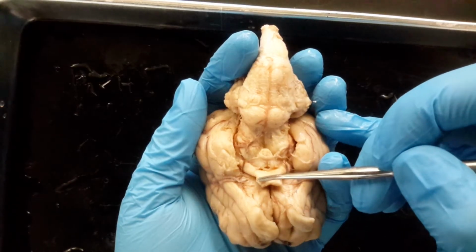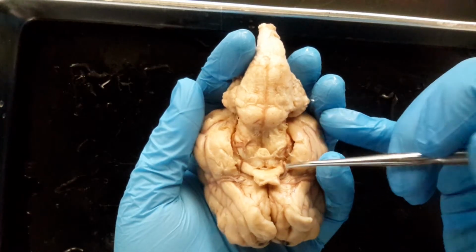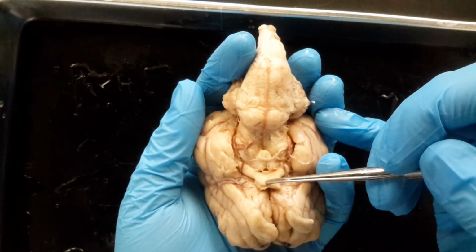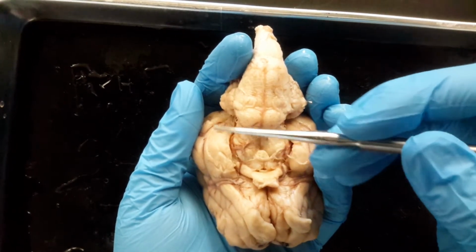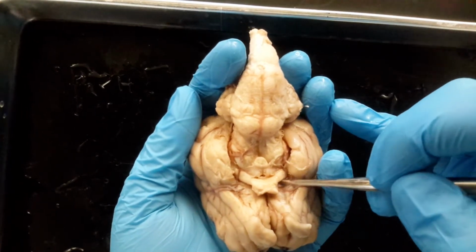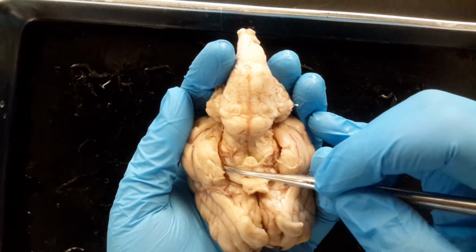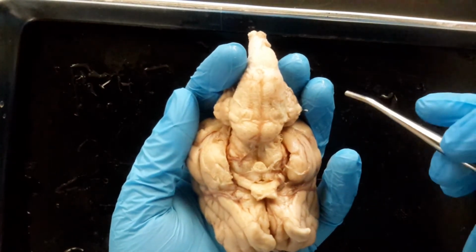So normally you'd have the optic nerve traveling up here to one eye and the optic nerve traveling up here to the other. This X is called the optic chiasm. That's where some of the nerve tracts switch and move to the opposite side of the brain. Okay, so some from the right move to the left side and vice versa. We'll get into more detail in class about that, but just know the X is the optic chiasm, and the portions behind it are the regular optic tract. That's the tract. Okay.